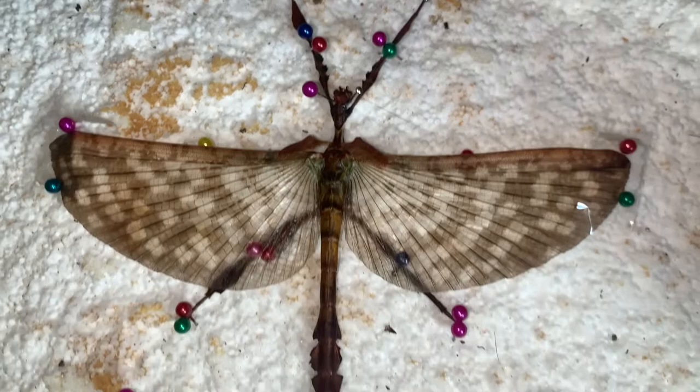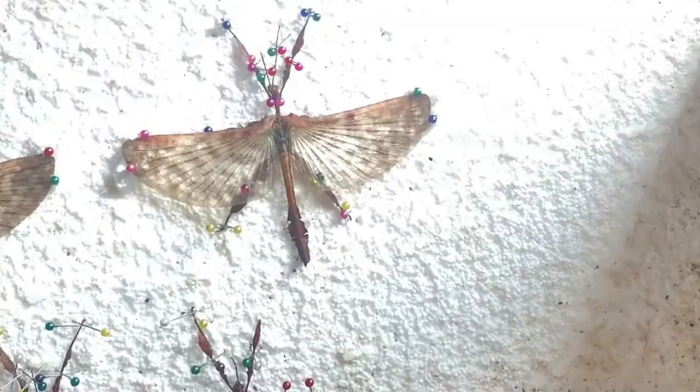In this video I'll teach you how to pin and preserve a male giant prickly stick insect with the wings spread apart.